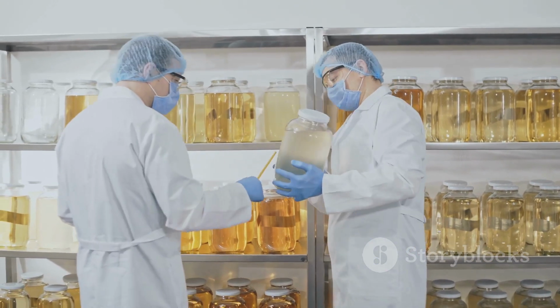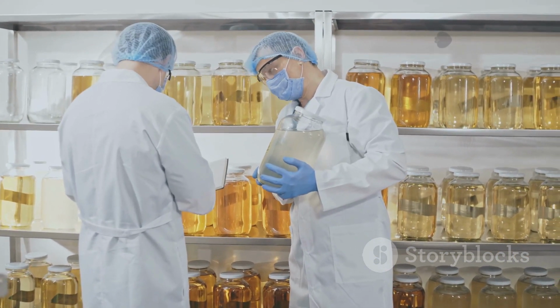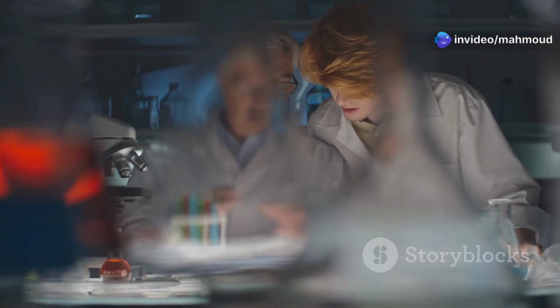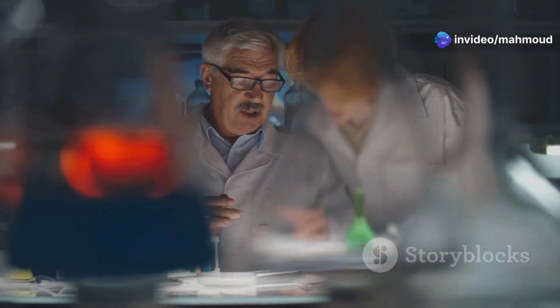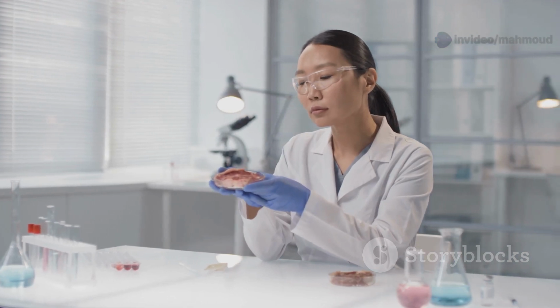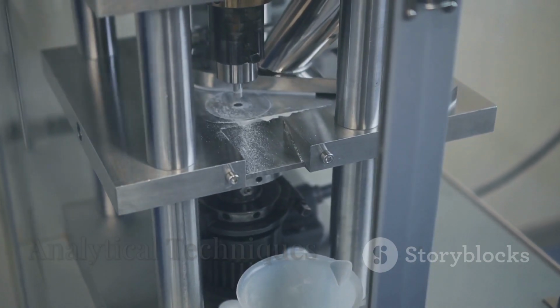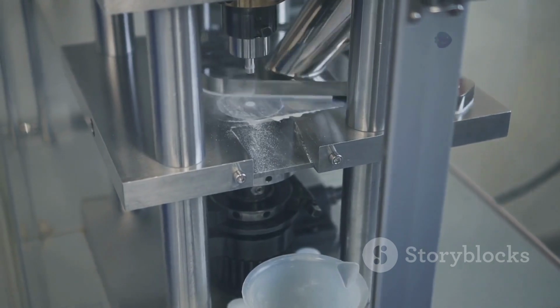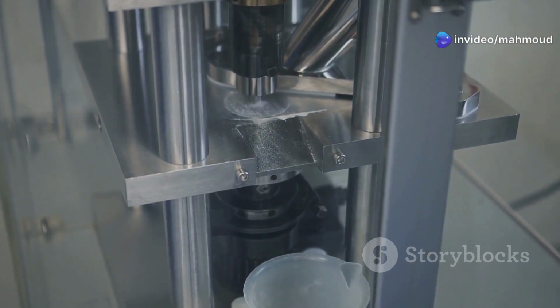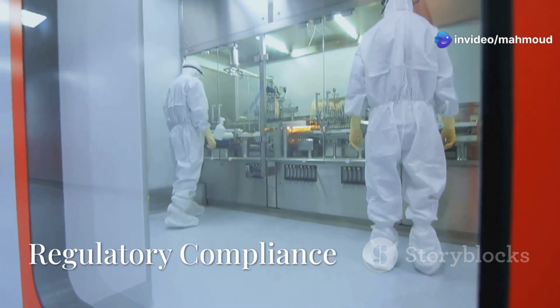Throughout this entire process, quality control is paramount. Samples are taken at various stages for testing. This includes checks for consistency, pH levels, active ingredient concentration, and, of course, microbial contamination. Sophisticated analytical techniques like chromatography and spectroscopy are used to ensure each batch meets strict quality standards.